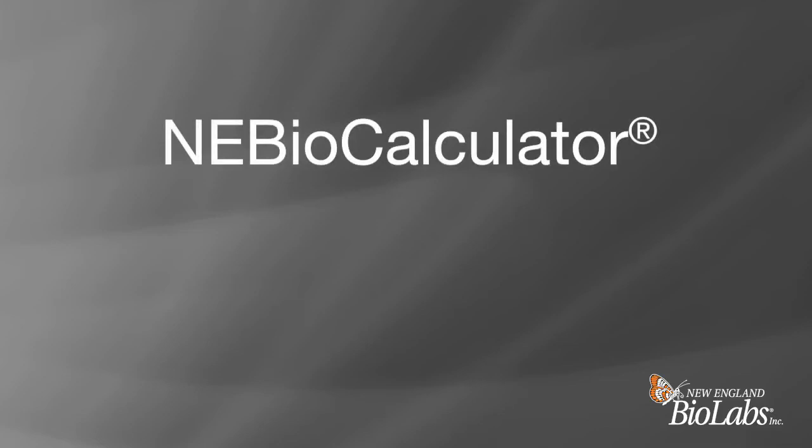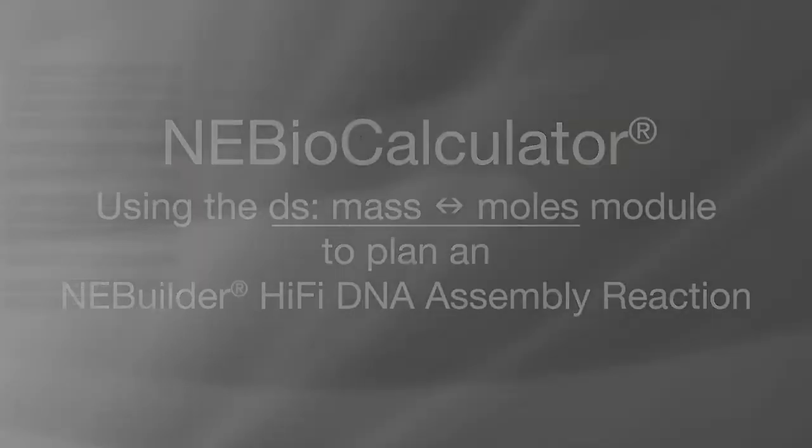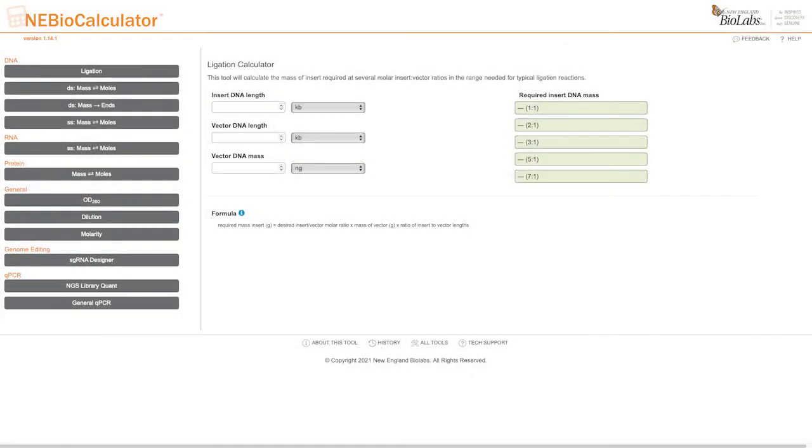NEBioCalculator is an easy-to-use tool that contains various modules to help with biomolecular calculations. In this video, we will demonstrate how to use the double-stranded DNA mass to from moles converter to plan an NEBuilder HiFi DNA assembly reaction.